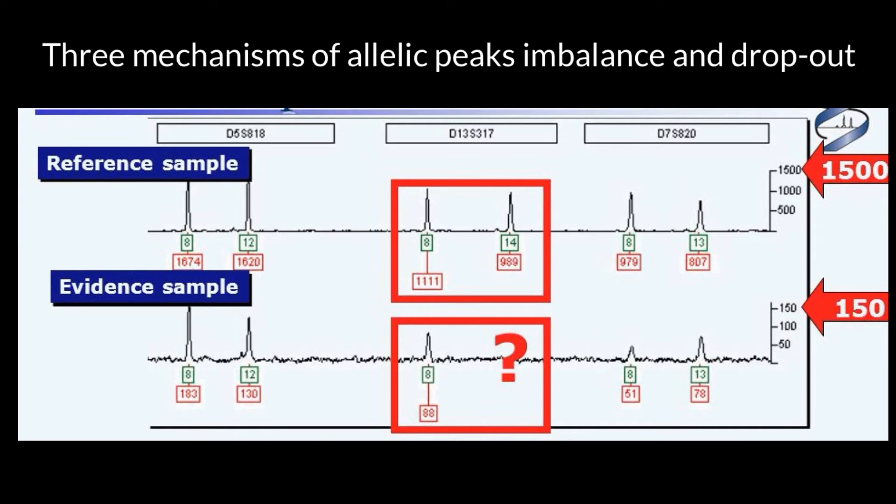This would be much more difficult because here we are basically dealing with noise. So we have to understand whether these peaks are noise or actually alleles.